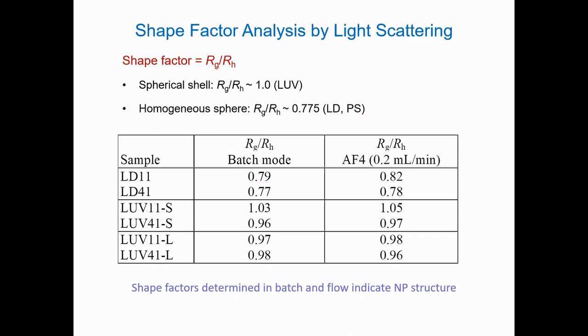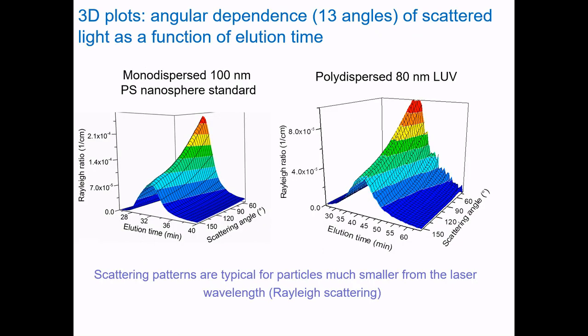Due to incorrect determination of hydrodynamic size at faster longitudinal flow rates, the shape factor cannot be used as a parameter from which we can infer particle shape and thus vesicle deformation. Therefore, we had to find another way to extract the particle shape, in this case solely from static light scattering data recorded in flow mode.